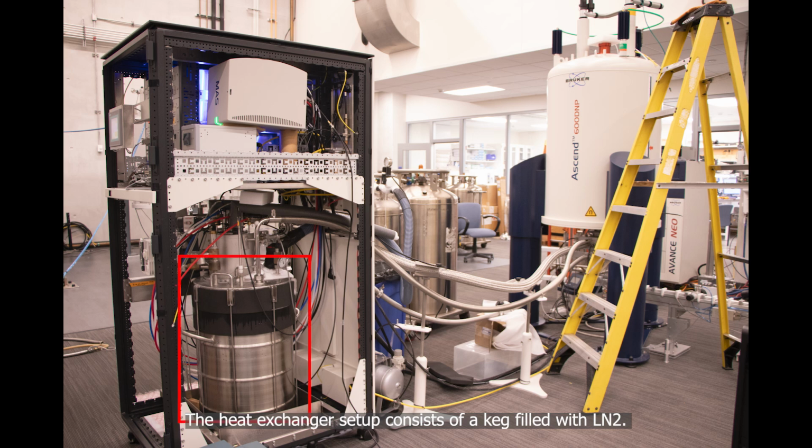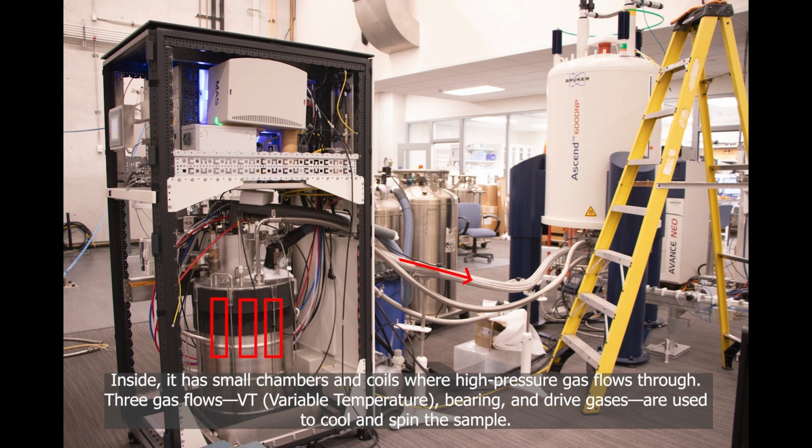The heat exchanger setup consists of a keg that's filled with liquid nitrogen. Inside it has small chambers and coils where high pressure gas flows through. There are 3 gas flows: the VT to control the sample temperature, and the bearing and drive to control the spinning.